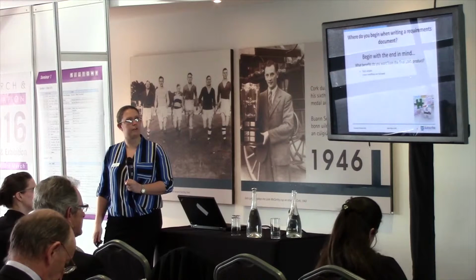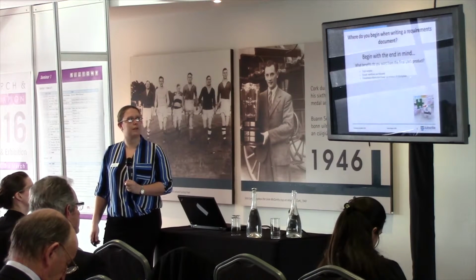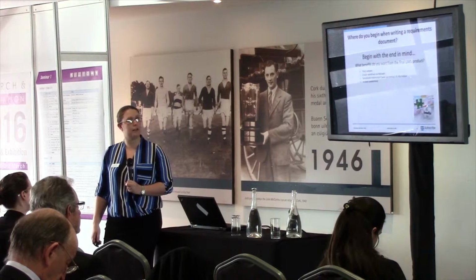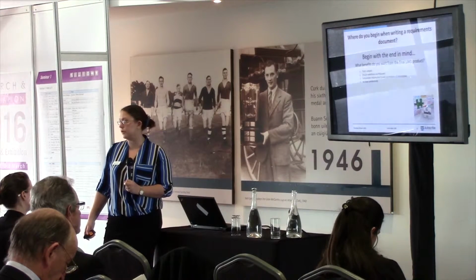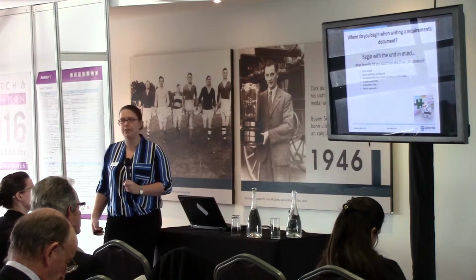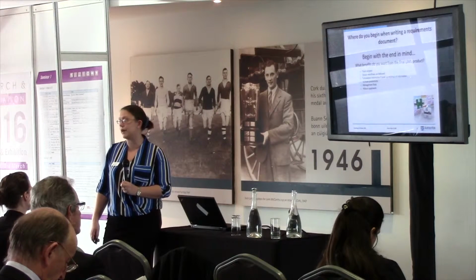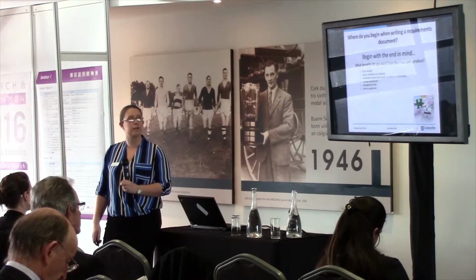Do you need to track samples? What workflows need following? How quickly things need doing? Is this going to increase productivity? The management tools? Reducing paperwork. So many different places are looking for a paperless lab now, and LIMS systems can help you with that.